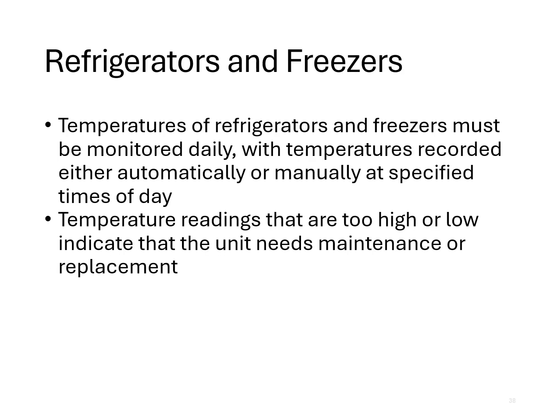Refrigerators and freezers. So temperatures of refrigerators and freezers are actually monitored daily, with the temperatures recorded either automatically or manually at certain times throughout the day. Temperature readings that are too high or low indicate that the unit needs maintenance or replacement. Depending on where you work, you may be responsible for taking these temperatures. And it's very important because we need to make sure that we have all of our specimens at the right temperature and that we have all of the reagents that we use at the right temperature as well.